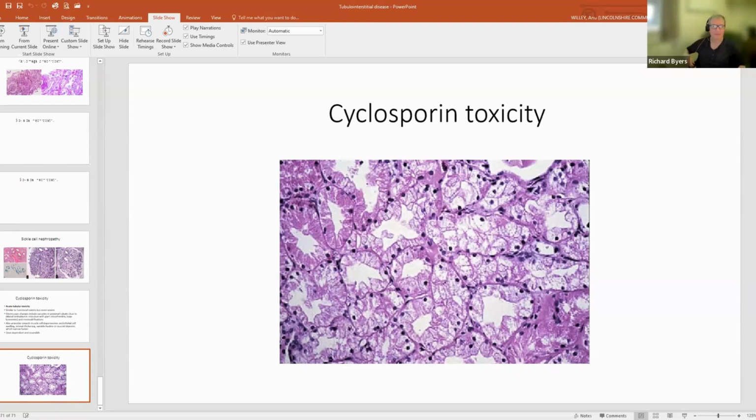And also, because of the cohort of elderly people who get biopsied, we do see a lot of light chain cast nephropathy and tubulointerstitial disease related to that. It is not uncommon. And every single case I've shown is from this year's diagnostic workload. None of these cases are from any sort of hi-fi things. They're all the cases which I've had. I've had a sickle cell nephropathy recently.